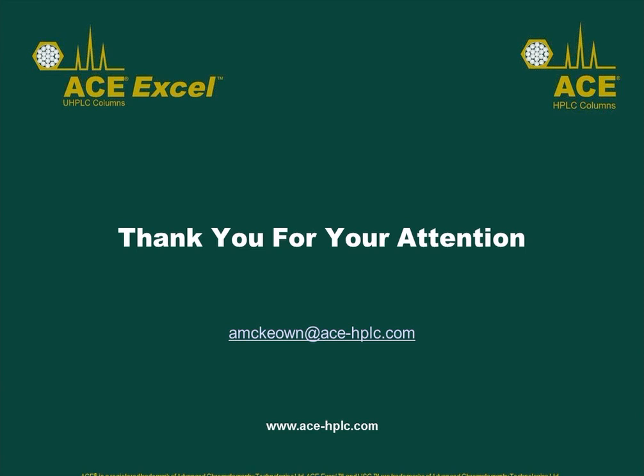That is a great call, Alan. Well, basically I spent two years comparing C18 and C18, so that answers the problem that I was having. Okay, so we can squeeze in one last question, and that is, you showed that the lifetime of your ACE columns is excellent. What is the cost of those compared to a conventional C18?